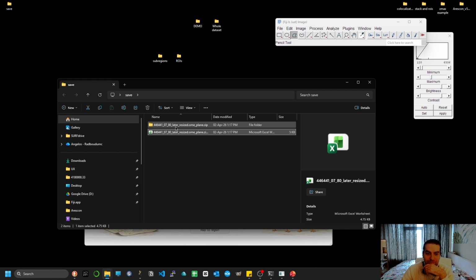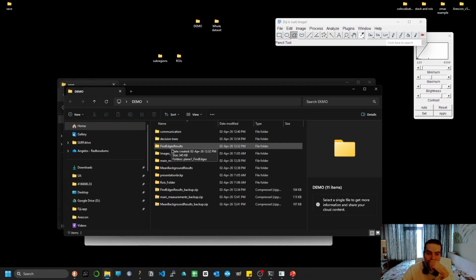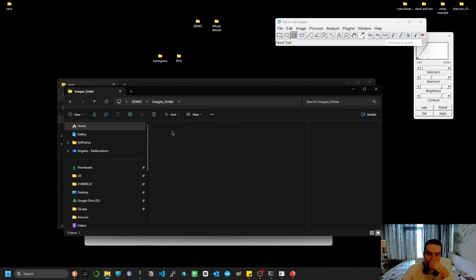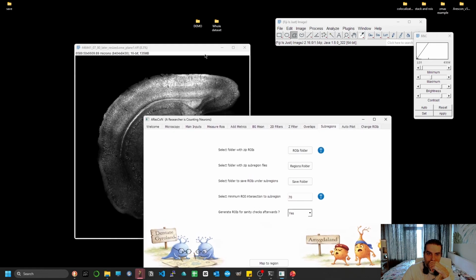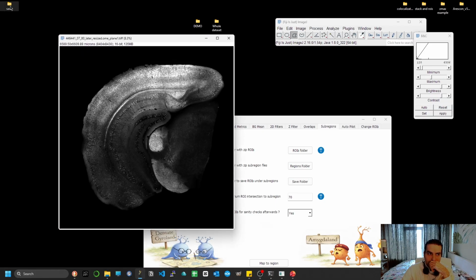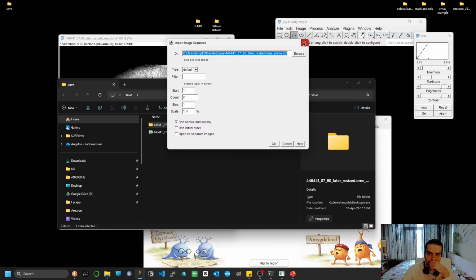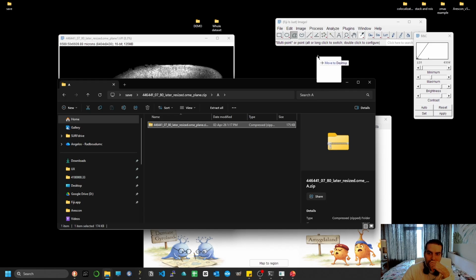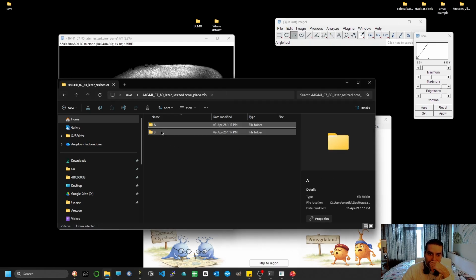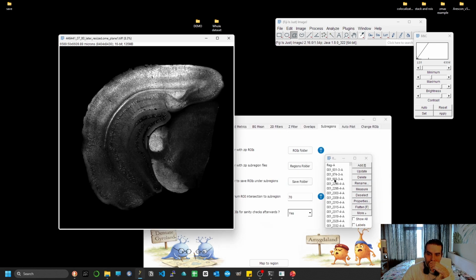And if you want to also run some sanity tests, let's open the demo image again. And let's navigate to the save folder, and let's place the regions of interest for the A and the regions of interest for the B. And where's my ROI manager?